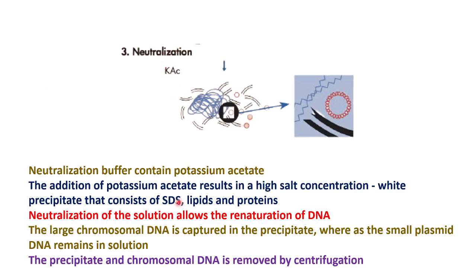As the solution is neutralized, the genomic DNA and plasmid DNA start renaturing and forming double-stranded DNA.